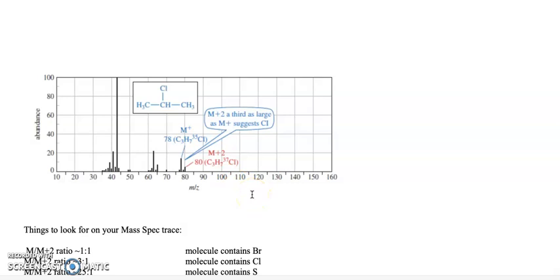Now, I will make it clear on all of these samples that you have to analyze this semester that they're in about a 3-to-1 ratio. I'm not going to have you guessing and measuring with a ruler to say, is this 3-to-1 or is it less? I want it to be clear to you, so I will make sure it's clear.